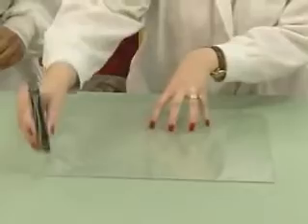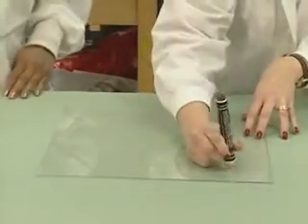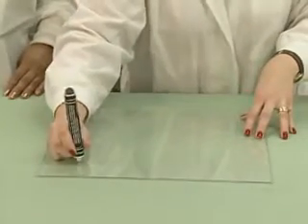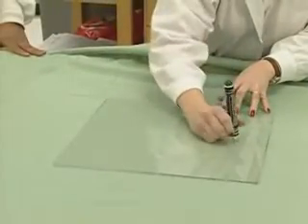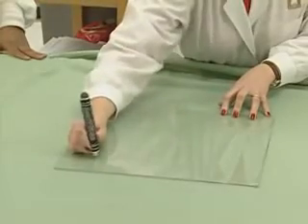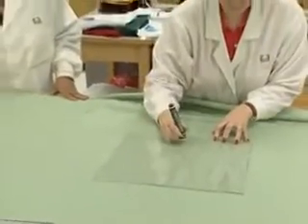Mark each specimen with 3 sets of length benchmarks and 3 sets of width benchmarks using a ruler, a stamp, or other suitable device. Make sure the ink used is indelible to laundering. Normally, 10-inch benchmarks are used as they make the mathematics easier to calculate. Some tests call for larger benchmarks, which require the specimen to be larger than 15 inches square.